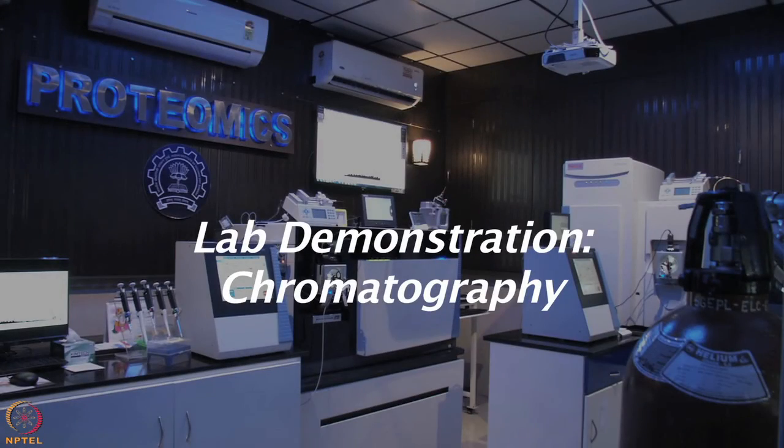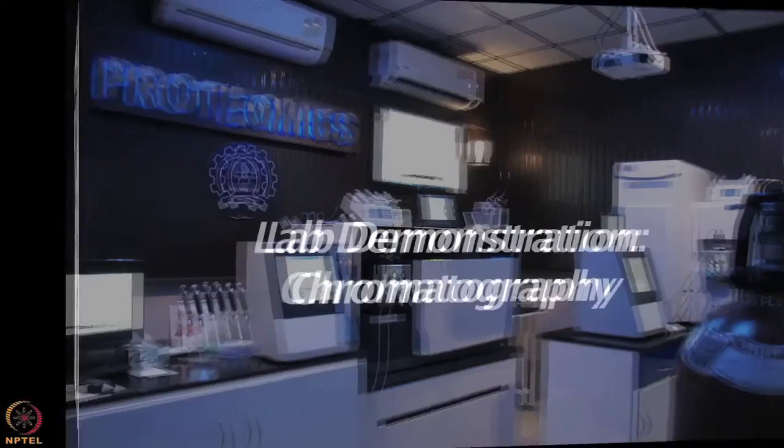So, we have learnt various techniques for performing gel based proteomics. Now, let us move on to chromatography based lab demonstration. You will see how specific proteins can be purified using chromatography. So, let us start the laboratory demonstration session for chromatography now.